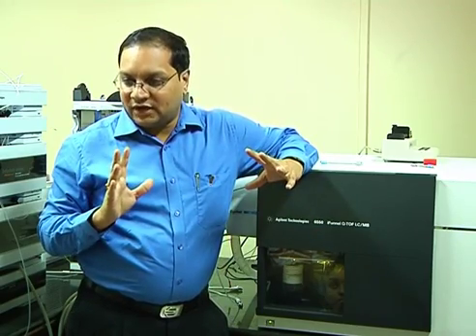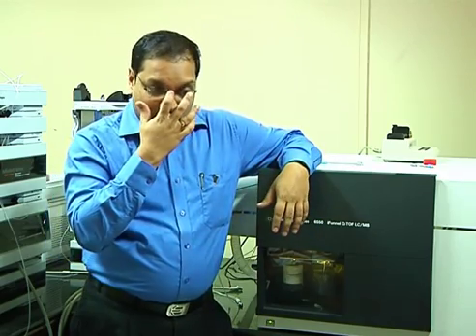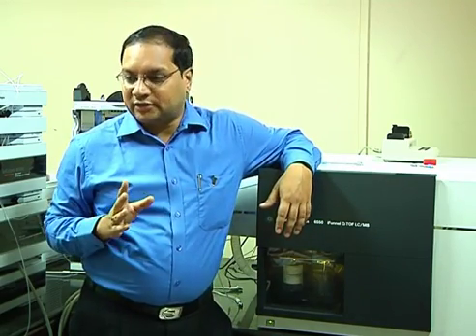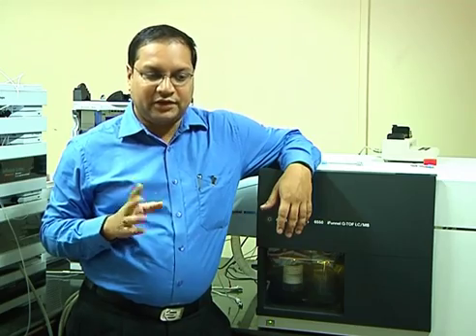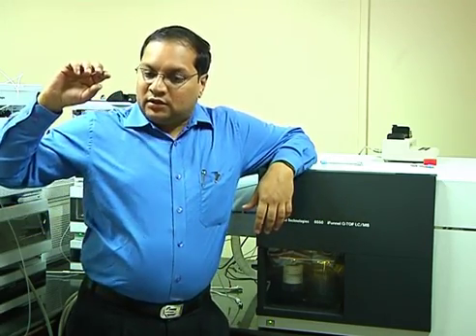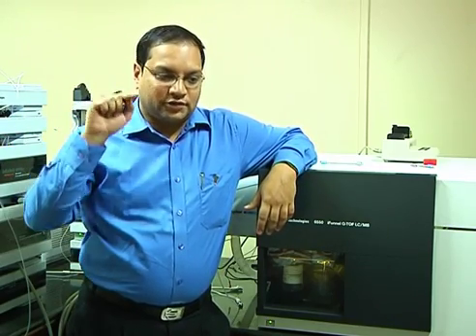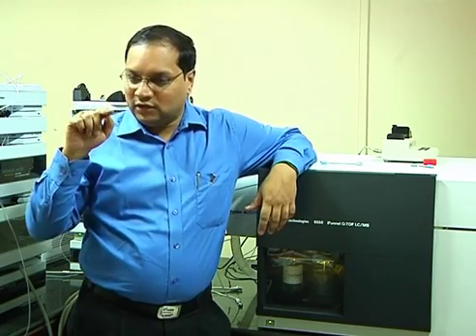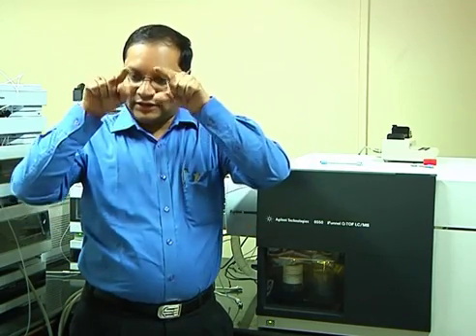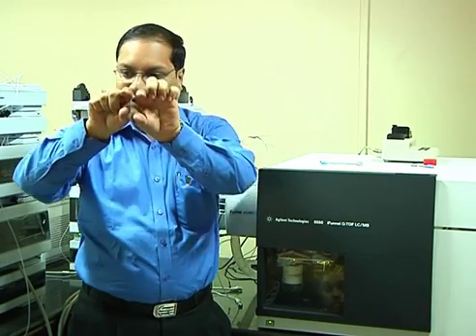Quadrupole is one type of analyzer. Okay. Analyzer of mass. Mass analyzer. So quadrupole is also called as mass filter. It's also called as mass filter analyzer because of the way it behaves. Quadrupole means what? 4 rods. So 4 rods like this, positioned like this, at some length.